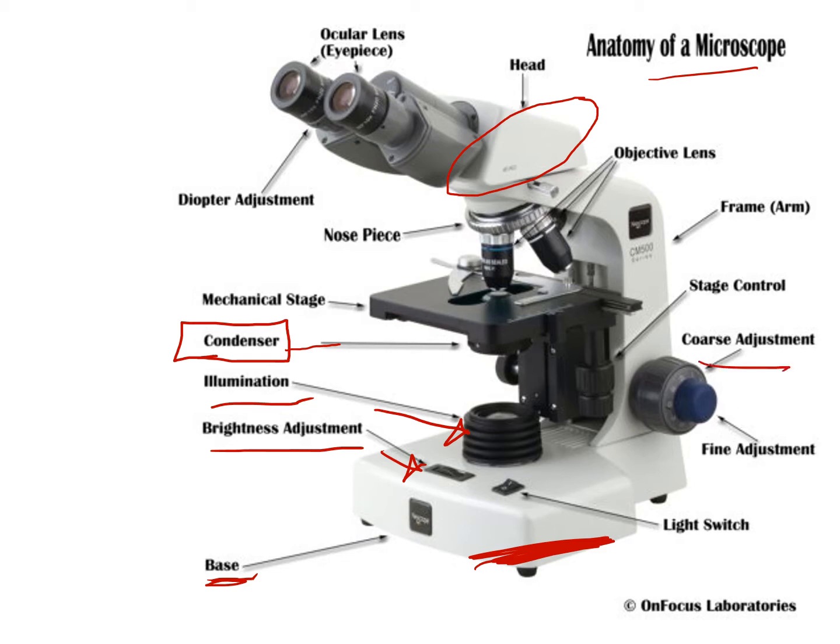Coarse and fine adjustment. That's for focus. And it moves the stage up and down. And so you can see right now the objective lens is really close to the stage. So if you use the coarse adjustment to move the stage up, you might smash it into the objective lens. That's bad. And lastly, here we have the ocular lens.